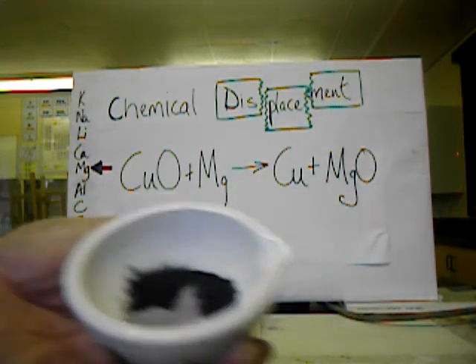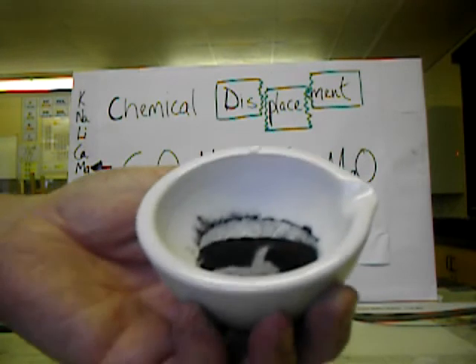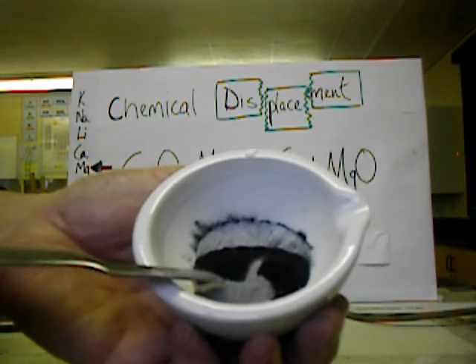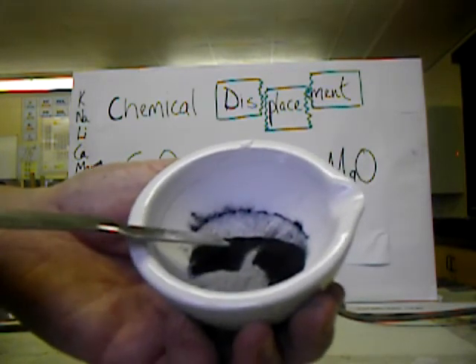I have here, in a mortar, a mixture of magnesium powder, the grey powder, and copper oxide, the black powder.